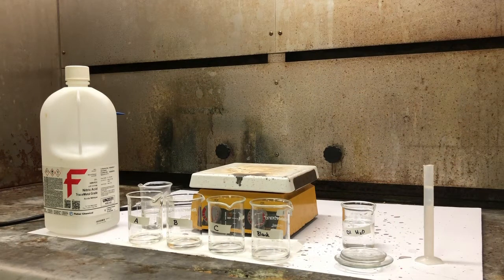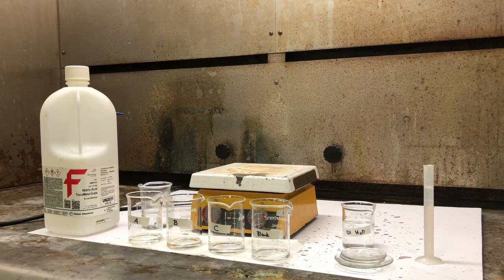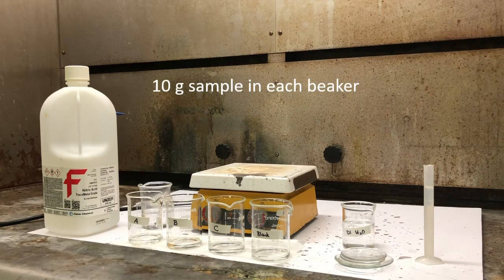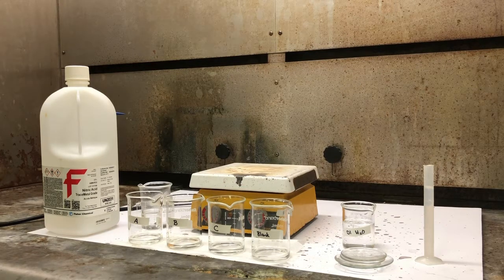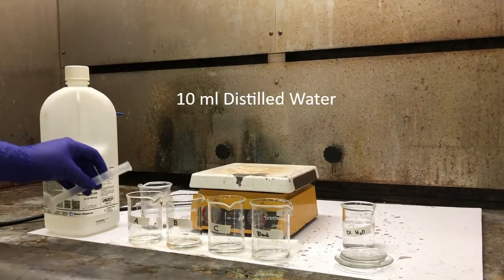Okay, so we have our samples ready to go. I've taken 1 sample in triplicate plus a blank. These 3, A, B, C, are a water sample, and the blank contains deionized water. We have the weights of the samples. I've weighed out approximately 10 grams of each water sample into each beaker. Now we're going to add 10 milliliters of deionized water to each one.